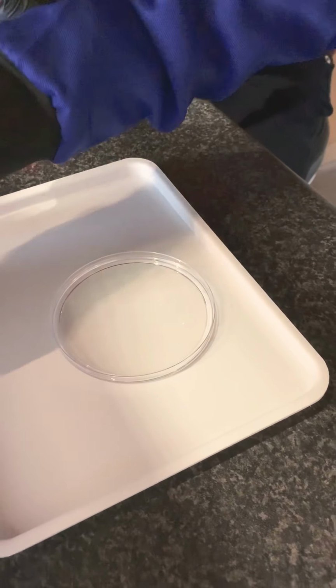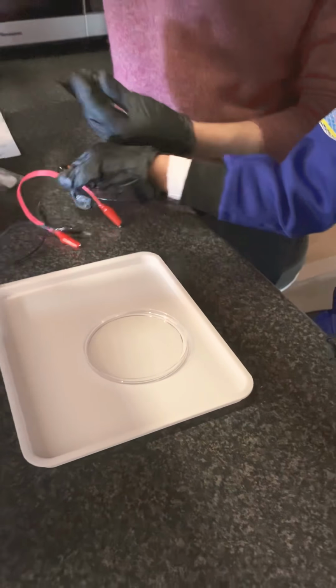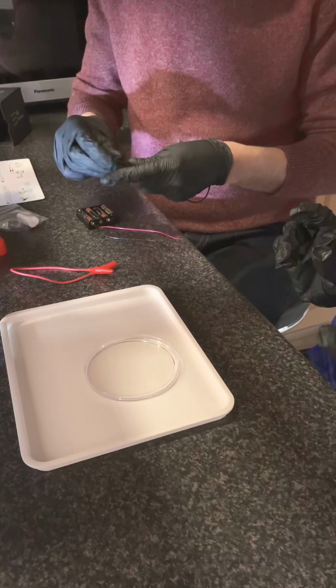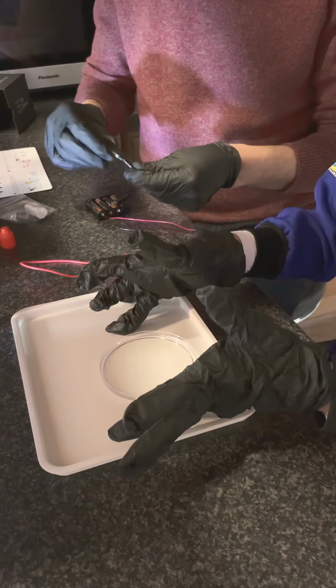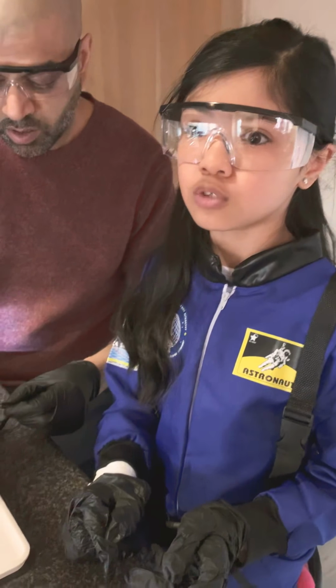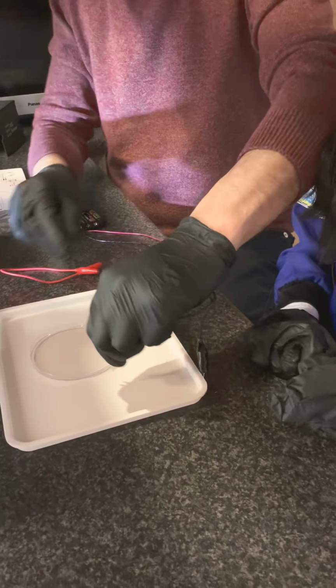Now, what you have to do is you need to attach one red crocodile clip and one black crocodile clip on opposite sides each. And remember, when you're doing this, make sure you have adult supervision.